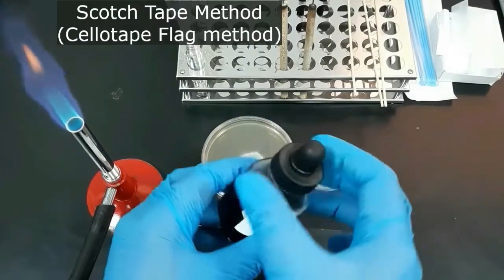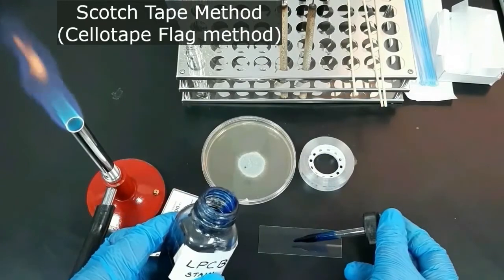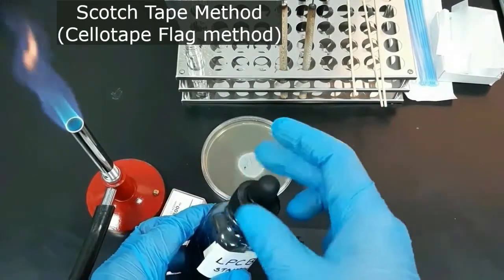Next I will demonstrate the cellar tape flag method, or scotch tape method, to examine the fungal structures. First, place a drop of lacto phenol cotton blue stain on a clean glass slide.